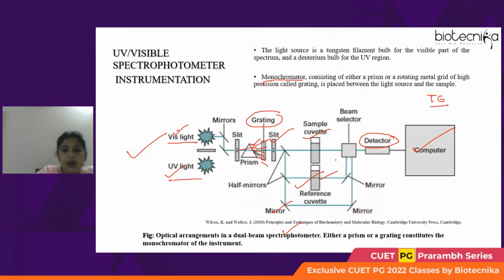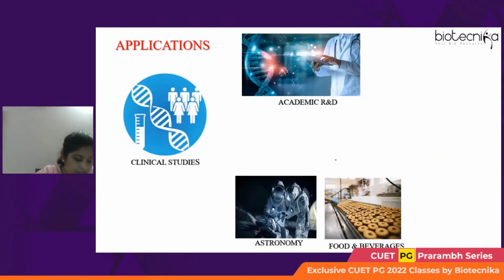Right? So what are the applications? Why do we use spectroscopy? Okay, Shrutika, you asked me whether the molar extinction coefficient is of DNA or the solvent used. It is the molar extinction coefficient of every chemical species that you are studying. That chemical species, whatever you are studying, can be an organic compound, DNA, or protein. In proteins, the absorbance is because of aromatic amino acids, right? So tryptophan has a molar extinction coefficient, phenylalanine has a molar extinction coefficient. Clear to all? Chemical species which are present.